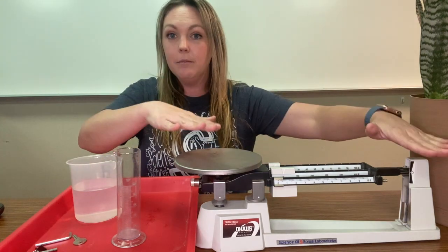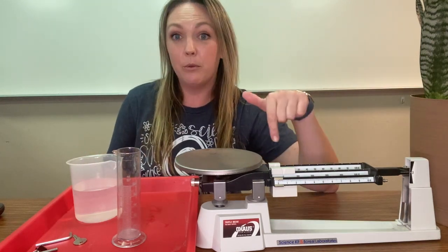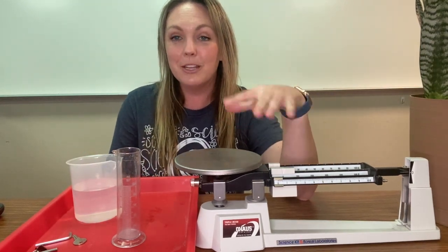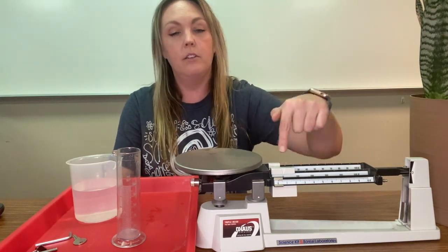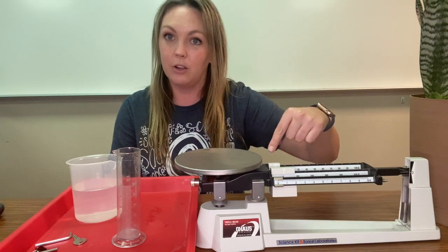This right here is a triple beam balance — there are three beams — and this is used to measure mass. If we put something on here, we're measuring against the balance of these triple beams and the weights that are on top of them.